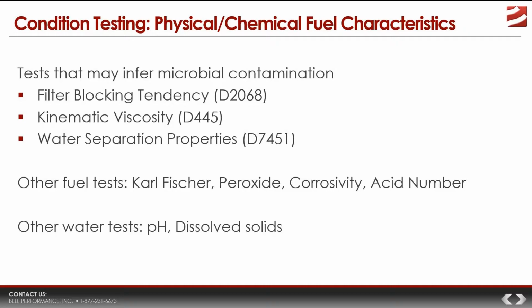First, tests done on the fuel: you've got Karl Fischer water content, you've got peroxide number, you've got fuel corrosivity, total acid number. And then tests done on the water: pH. Always best to do pH on the water phase, and total dissolved solids in the water.